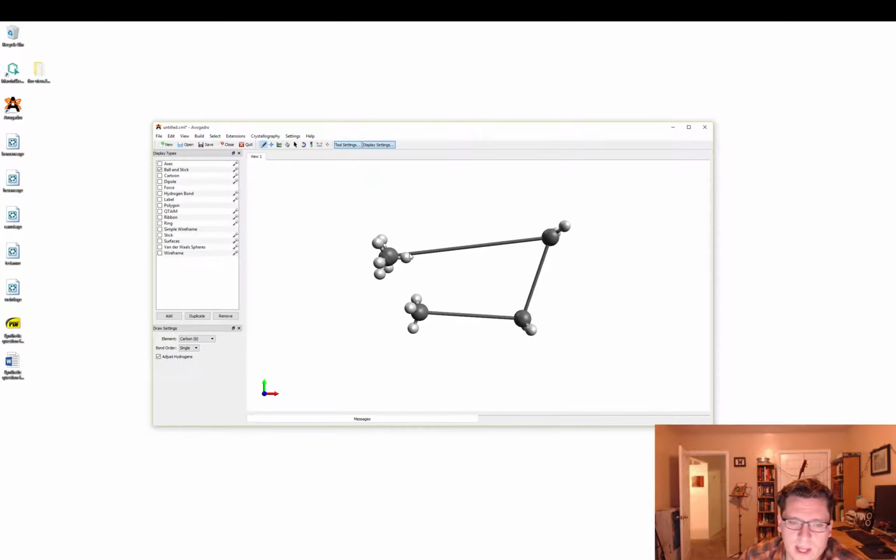and boom. Now, this is actually something that happens all the time. This happens way more in Avogadro than it does in the two-dimensional, where you have that little air. So you're just going to have to undo that. You can do that with Control-Z, and then you can come back and fix up your drag and drop and get it however you need it to be.